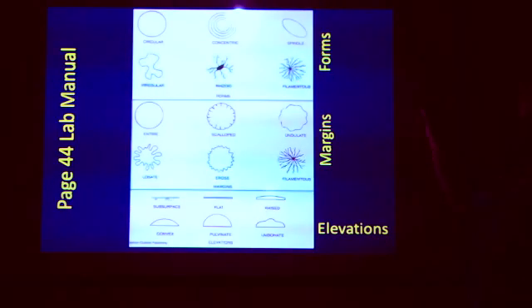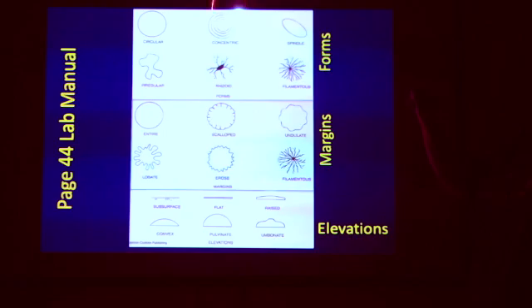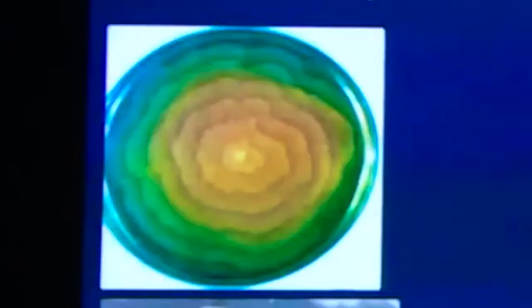I also mentioned the concentric up here at the top, right? Look at that one. Doesn't get more concentric than that. It looks like a bullseye.